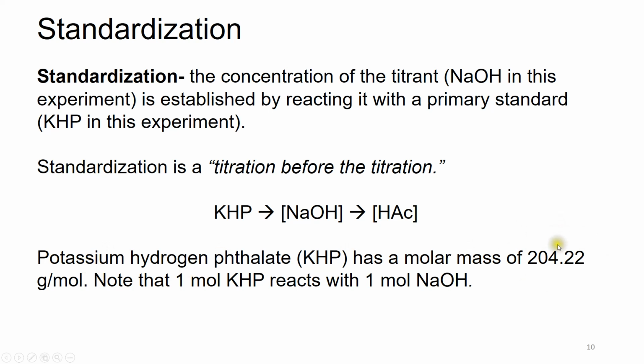And we need to use this number later because we're going to weigh KHP, and the mass divided by molar mass, we get the number of moles. And the number of moles of KHP is the same as the number of moles of sodium hydroxide.